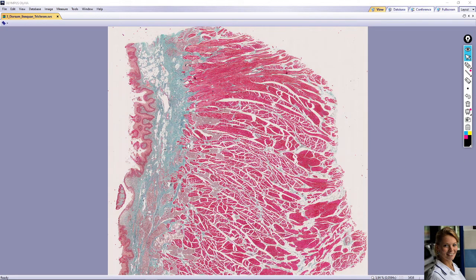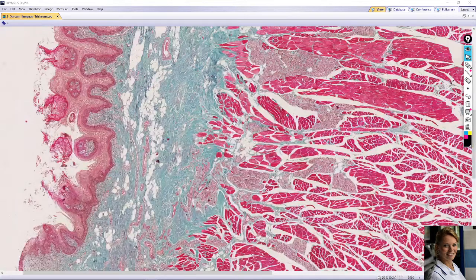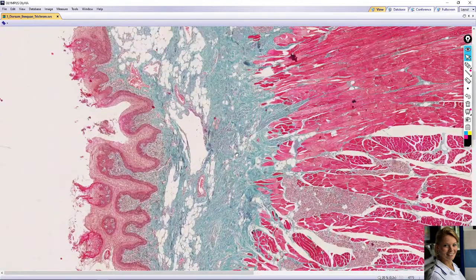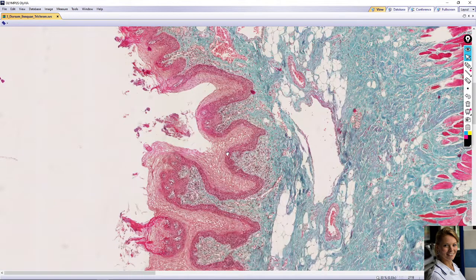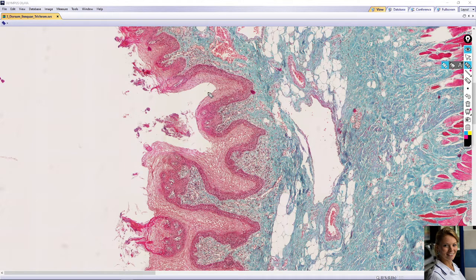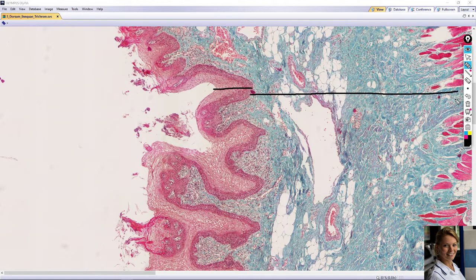The oral cavity, including the tongue, is lined with protective mucosa that consists of an outer epithelial layer of stratified squamous non-keratinized epithelium and underlying connective tissue. Here is the epithelial layer and the deeper connective tissue layer, also called lamina propria.